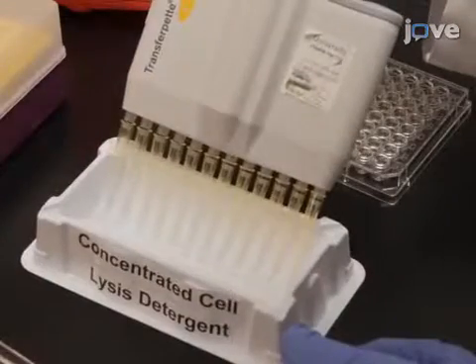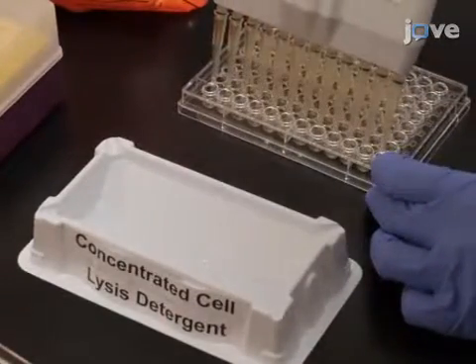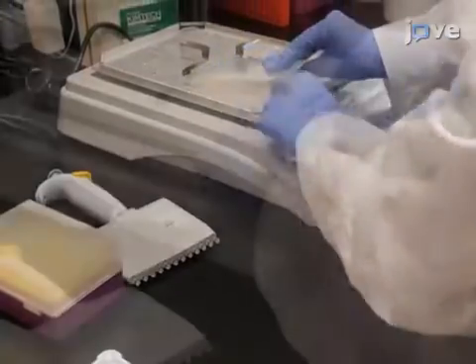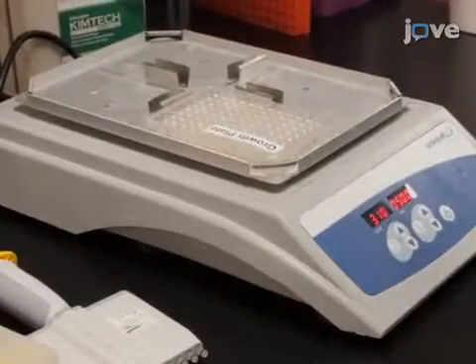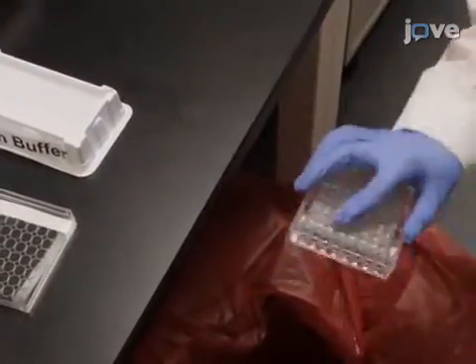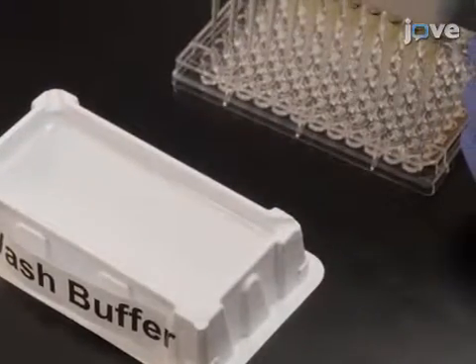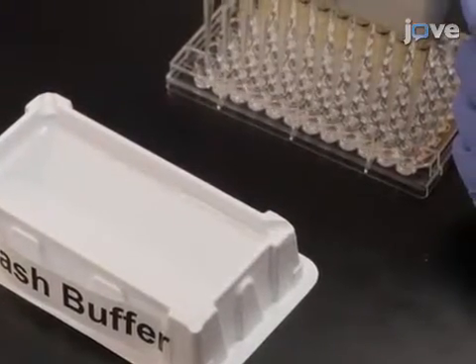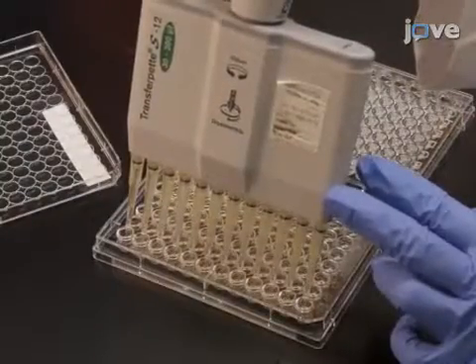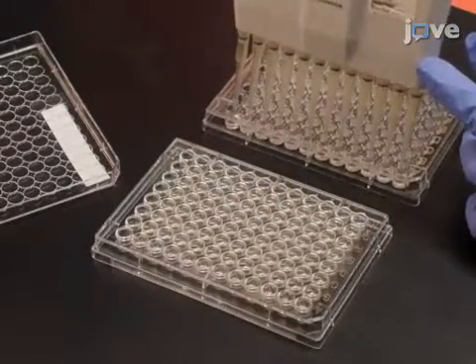Add 20 microliters of a concentrated cell lysis detergent to each well of the round-bottom culture plate and incubate on a microplate shaker at room temperature for 15 to 20 minutes. After removing the final wash, transfer 50 microliters from each well of the cell lysis plate to the corresponding well of the ELISA plate.